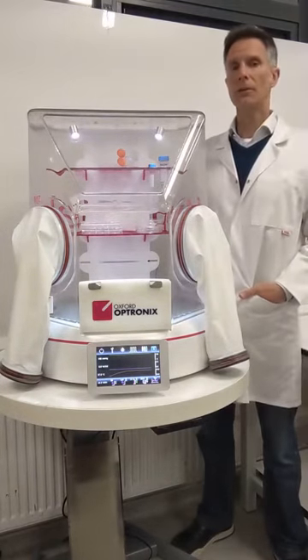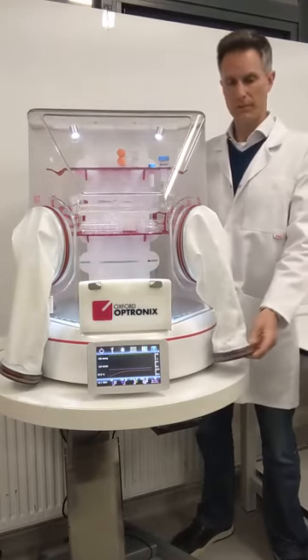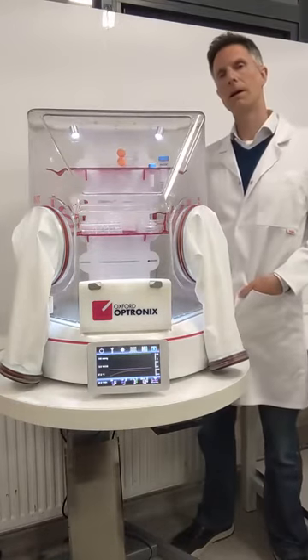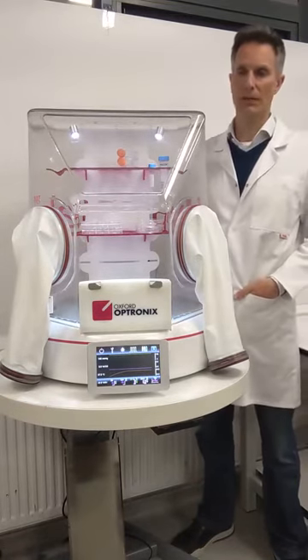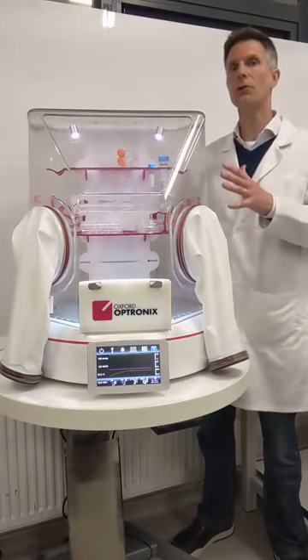In addition, the HypoxyLab supports access via arm ports and arm port sleeves for manipulation such as harvesting, passaging of cells, all while maintaining cells under that controlled oxygen state.